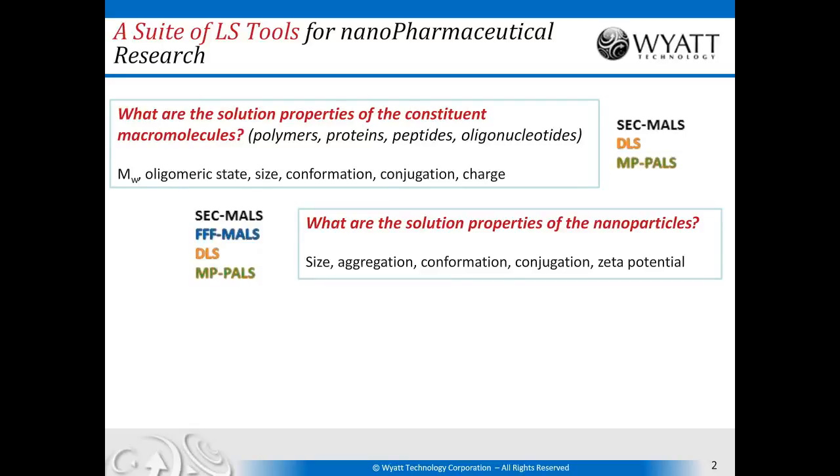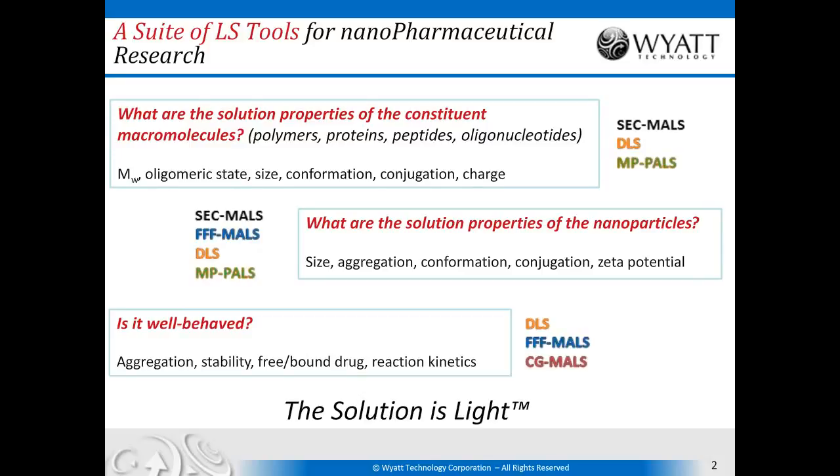Another set of questions you'll be asking are the solution properties of the nanoparticles themselves. So what is their size, aggregation state, the conformation of the particles, binding of functionalized ligands to the particles, and their zeta potential, which impacts stability.